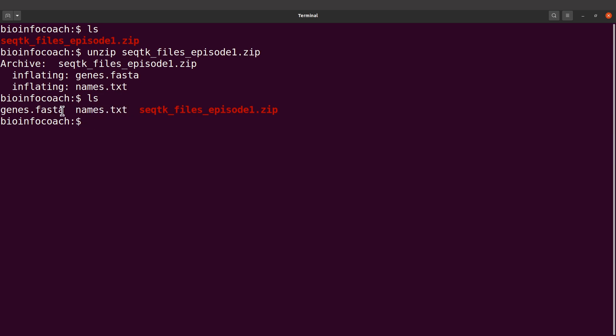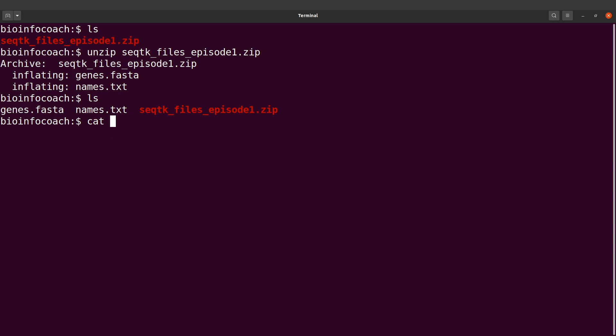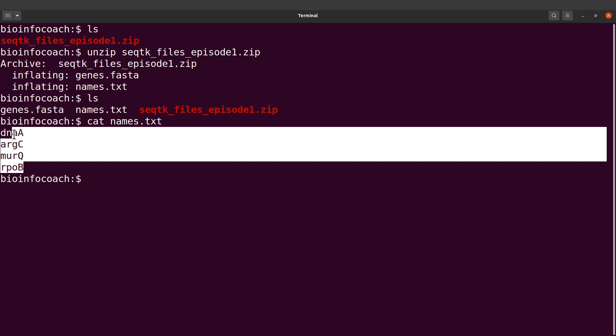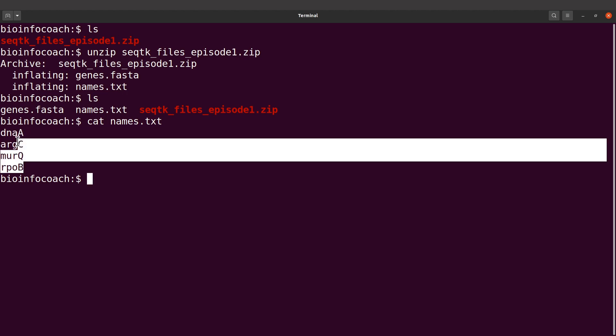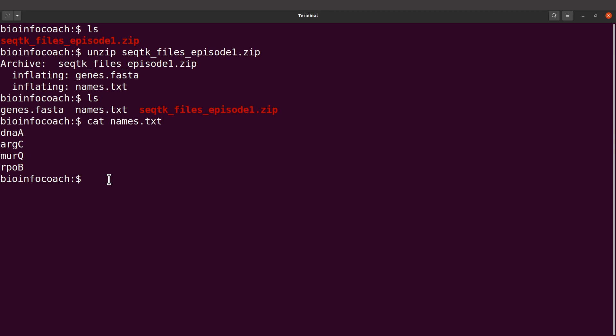These are the input files. There's a FASTA file which has sequences. For these sequences, we are interested in some of them. Those that we want to extract, the names can be found in this text file, names.txt. Let's display this one. Cat names.txt. We have four names. These are the sequences of interest.